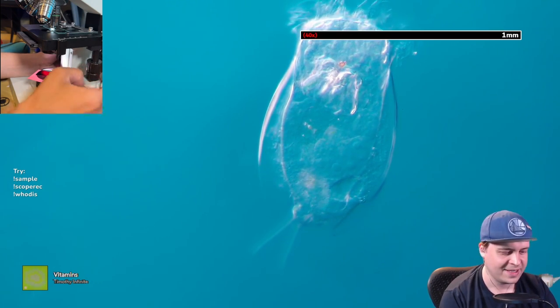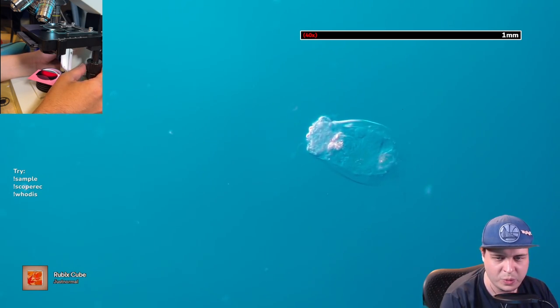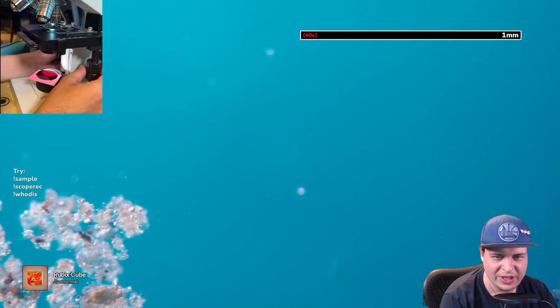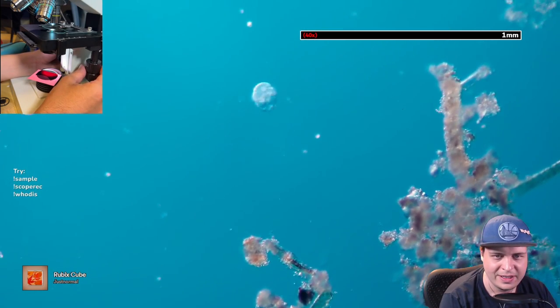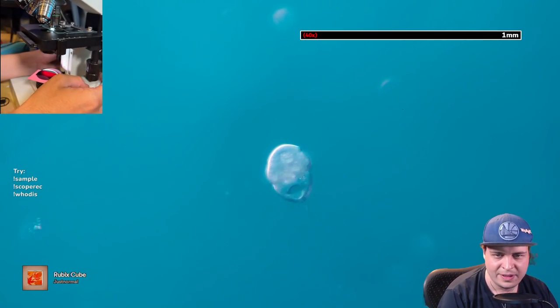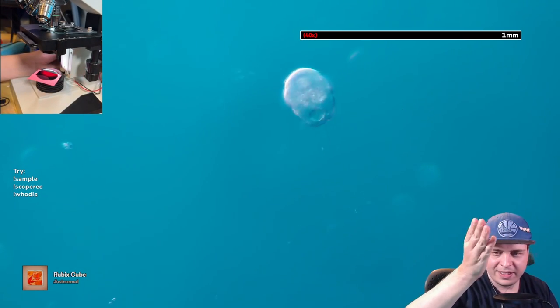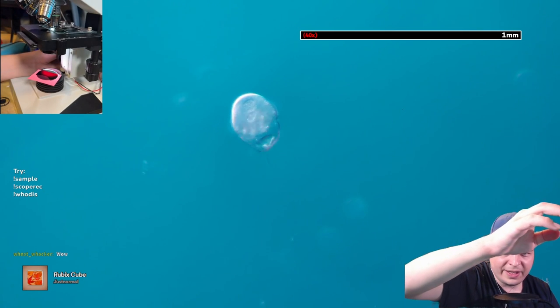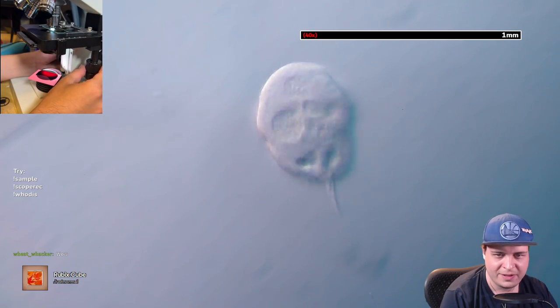I call this 'tropical sunset.' This is a form of oblique illumination, although a little more advanced. It creates some really great results — this turbo area is also a good example. You can see it's in a 45-degree slice: from the top left it's bright and the bottom right it's dark, and that's what gives this thing a sense of shape. This can even work down at 40x.